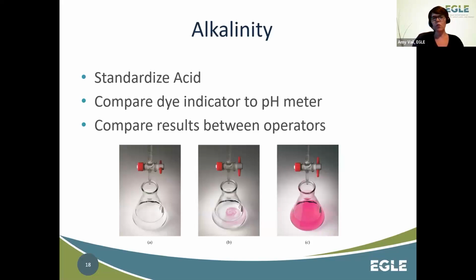It's also good to do comparisons between the operators, because you see things differently and colors look different. Some people are a little heavy-handed on the acid because they want to get the test done pretty quick, and a lot of times you can overshoot your endpoint. So just see how everybody does it and compare.